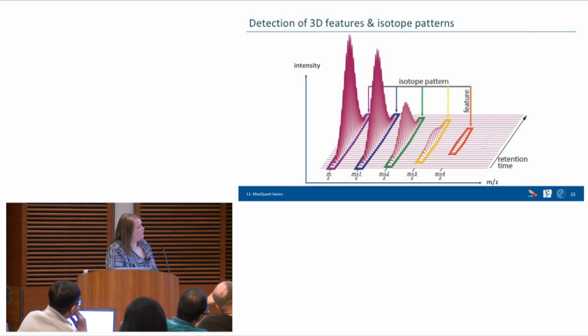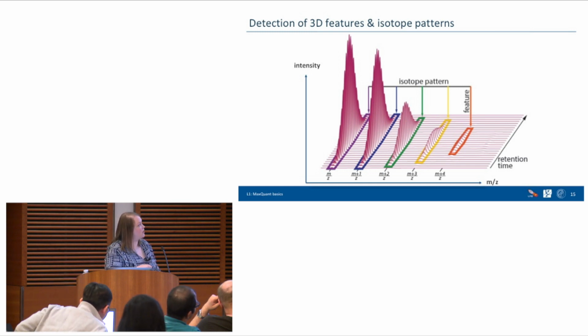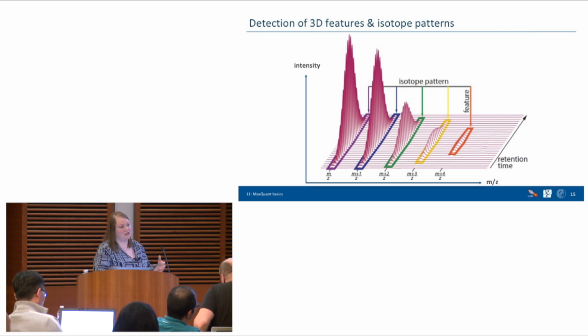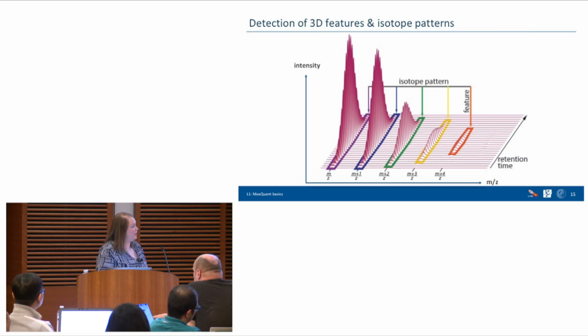We first try to assemble all the 3D peaks, and then, if we have all of them, we check whether we can assemble those into an isotopic pattern. When we have charge 1, we would expect the difference between those peaks to be 1 Dalton. This is one indication which allows us to do that. There are more, which I will explain later.